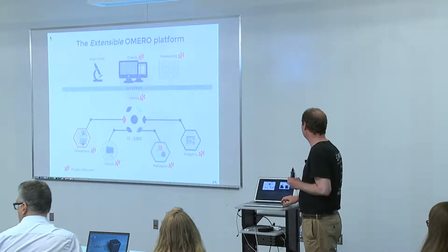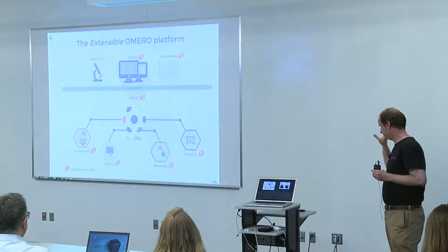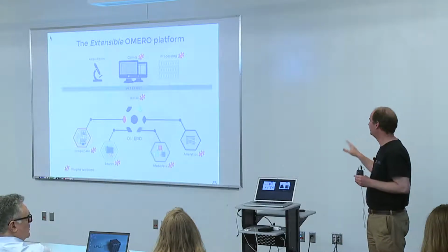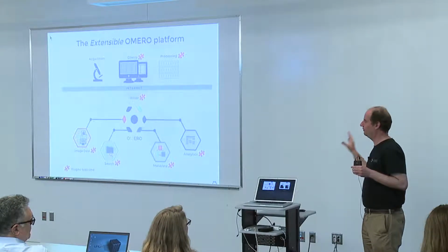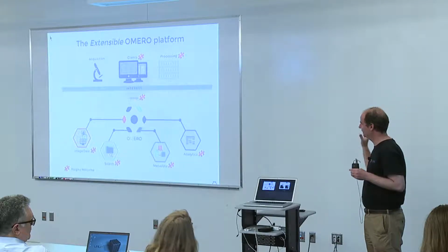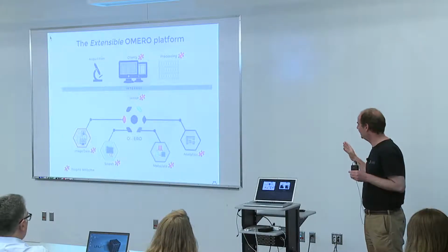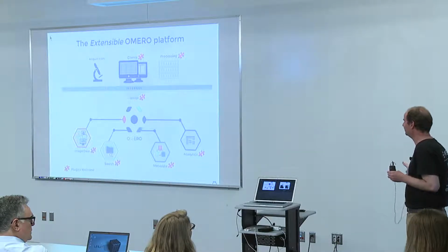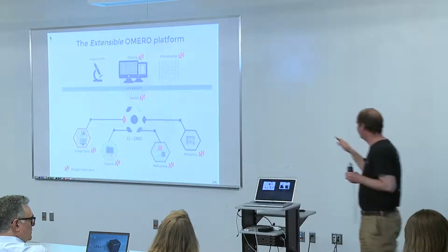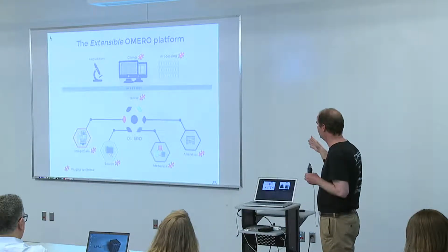I'm making a jump now between OME and OMERO, but forget it. If you are confused a little bit about what is happening here, there will be a talk. I will have a lightning talk tomorrow at 3:40. It's highlighted as a talk by Jean-Marie Burel, but no such luck. This will be me because Jean-Marie couldn't come. And I will go through the things on a more theoretical level once more there.